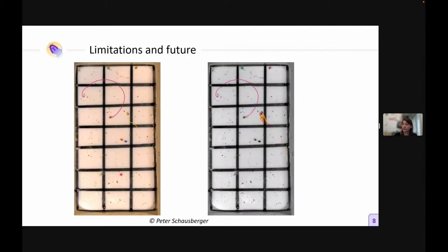He had the problem of having mites whose color was different from the background, but the value was the same. Once transformed in grayscale, the mites were the same color, the same value as the black lines here. So they were definitely lost each time they were crossing these lines. And with the new feature, we won't have this problem anymore.